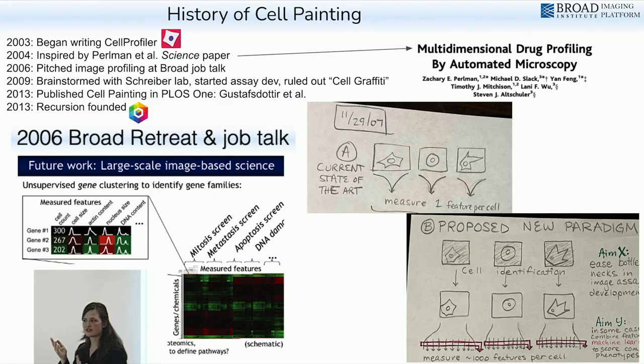But at the time, we were much more practical about the culture of biology, and we knew that if we told somebody, ooh, our magical assay system tells us that disease is differentiated from healthy controls, then the biologists would say, ooh, cool, how are they different? What's different? And we would just have to say, well, our black box assay and our black box algorithms tell us that the images look different, but we can't tell you exactly why. We knew that would be pretty unsatisfying at the time.